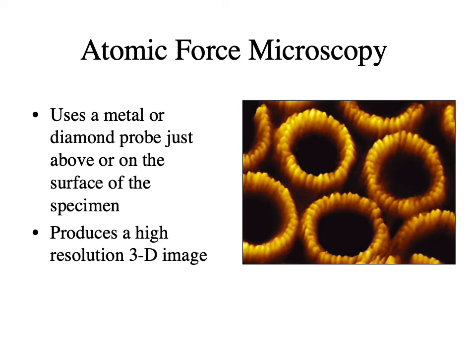Continuing with atomic force microscopy, you can also use a diamond probe. A diamond probe is much better because it will last longer. It's less likely to dull quickly, which a metal probe could do, and you may not know that it's dull, and you may not get an accurate image. But a diamond probe can last a long time, and the image will remain crisp, and the resolution will be high. It again can produce a 3D image, and it is of the surface of what it has been moved across.